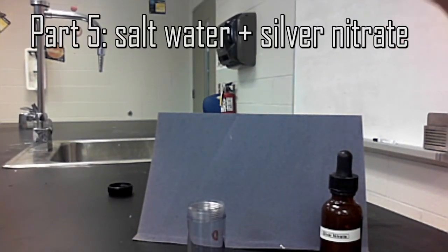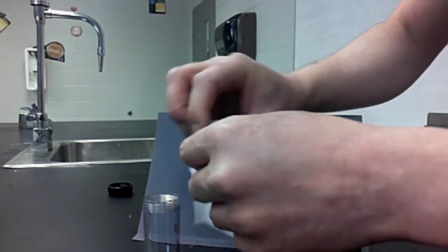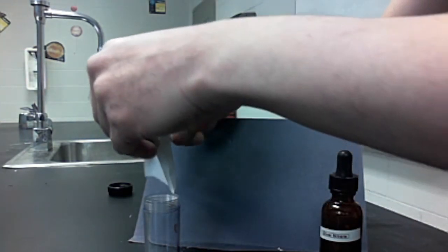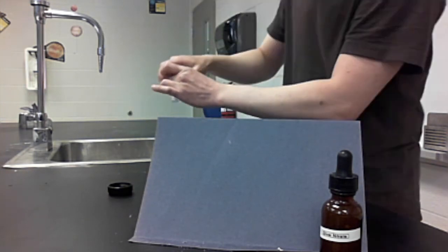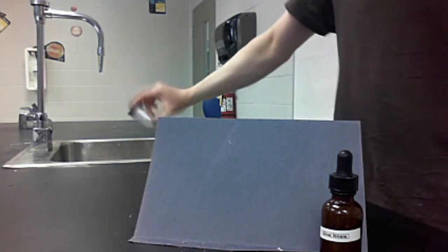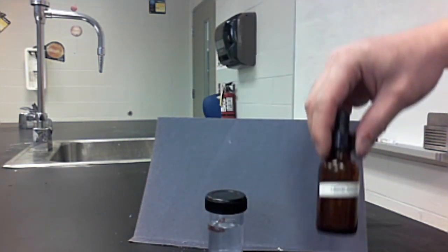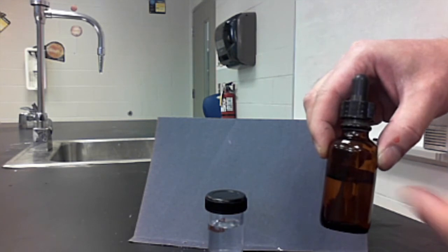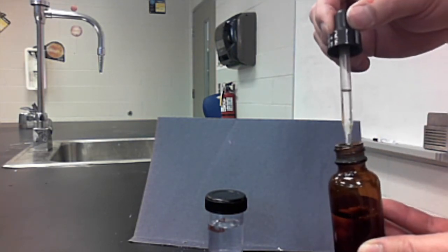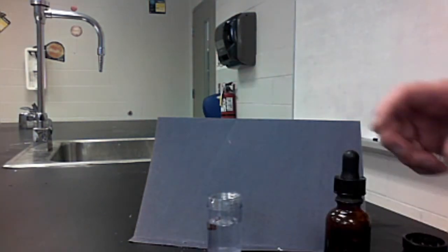For part five, we're going to combine salt water with silver nitrate. I'm going to make some salt water right now inside this vial. I have some sodium chloride crystals — I'll pour them into the vial, add a little bit more just to ensure a successful chemical reaction, and then add some water. There's the salt water — I'll shake it up so the crystals dissolve. What is also transparent is silver nitrate. Silver nitrate is normally left in a dark brown bottle because it will react with sunlight and turn dark. I'm going to put a few drops of it into the salt water.